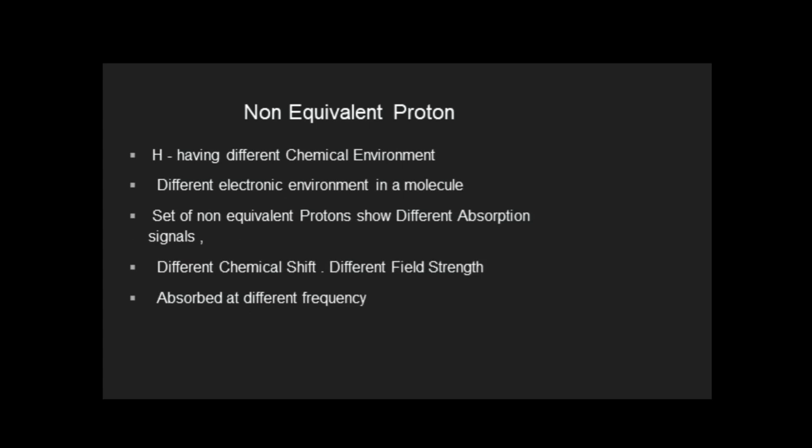In all organic compounds, there are two types of protons. One is chemically equivalent, another is chemically non-equivalent. What is a chemically non-equivalent proton? Protons having a different chemical environment, a different electronic environment. A set of non-equivalent protons shows different absorption signals in the NMR region, different chemical shifts, different field strengths, and absorption at different frequencies. Such protons are called non-equivalent protons.